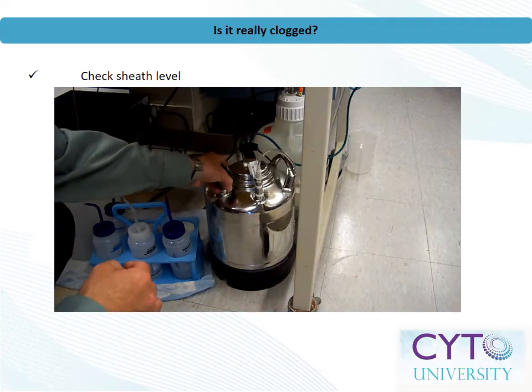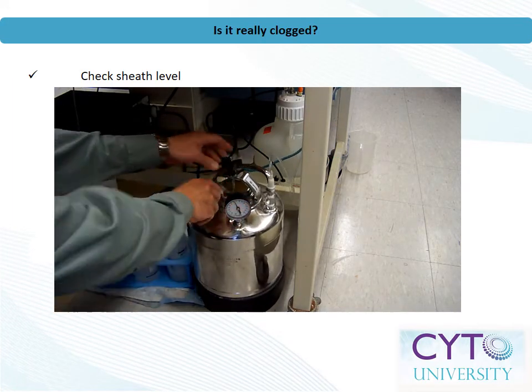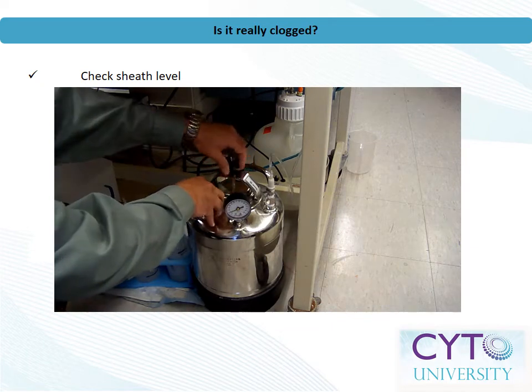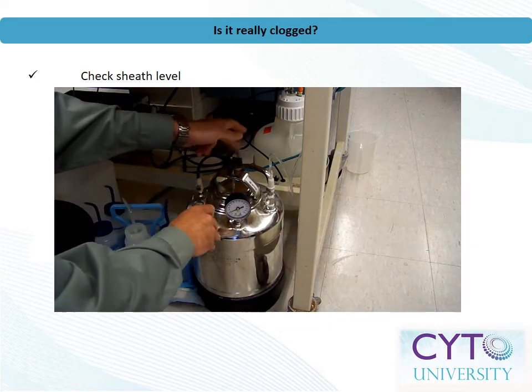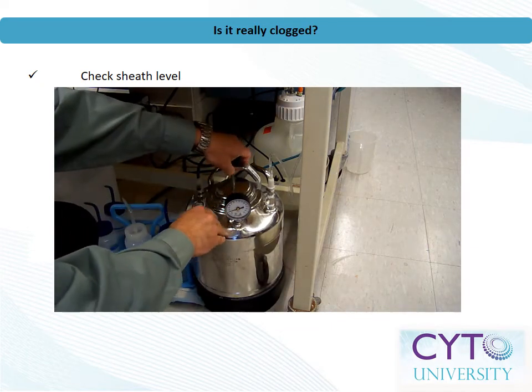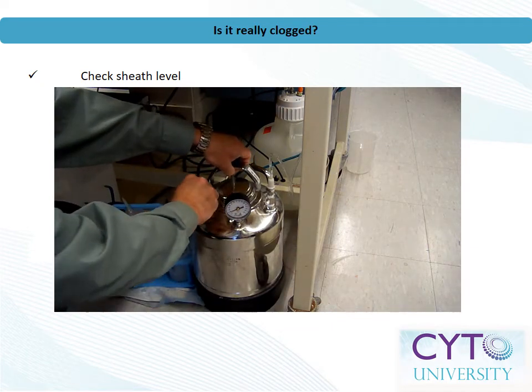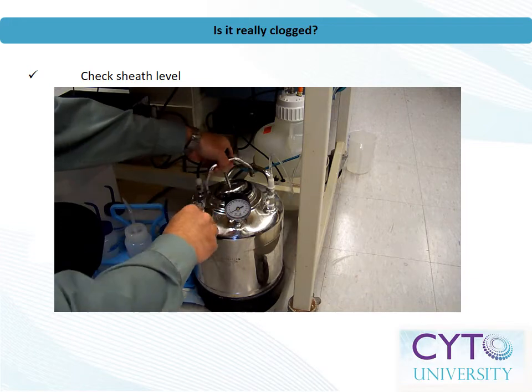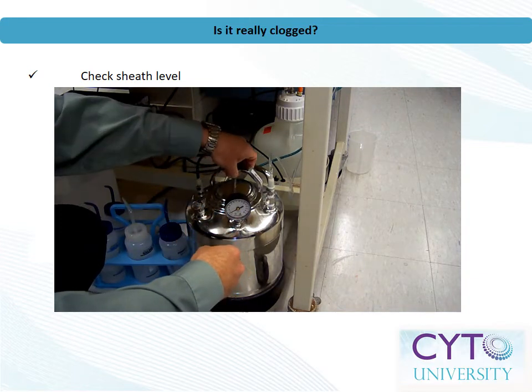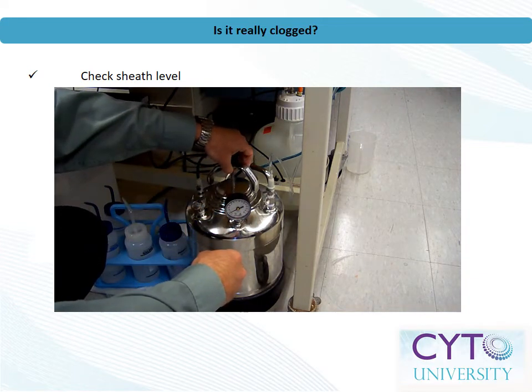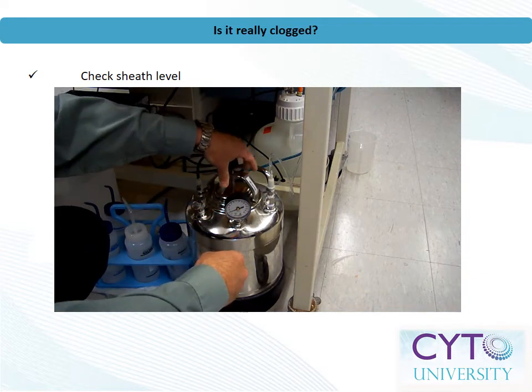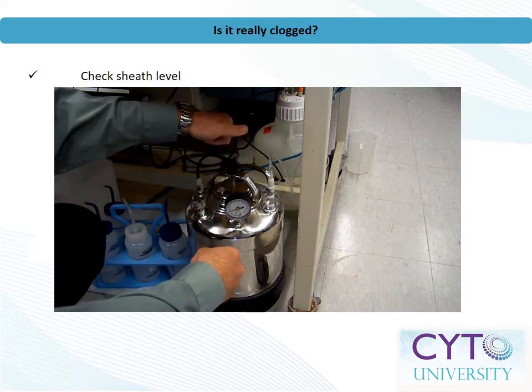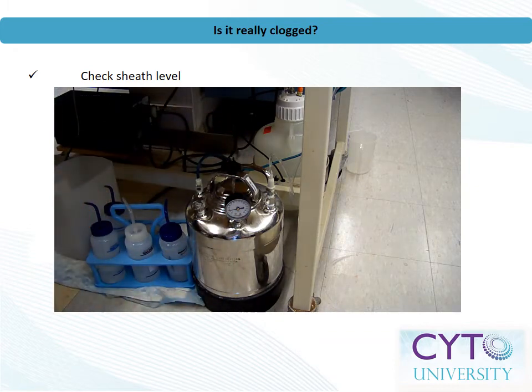To begin, the first thing to ask when presented with a loss of events on screen is: do I have a clog, or is there some other problem with the instrument? The easiest solutions are sometimes the right solutions. On the other hand, if you can see particulates or debris in your samples, you likely clogged the cytometer.